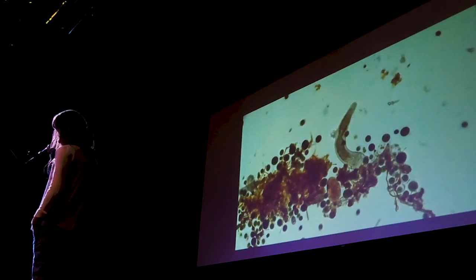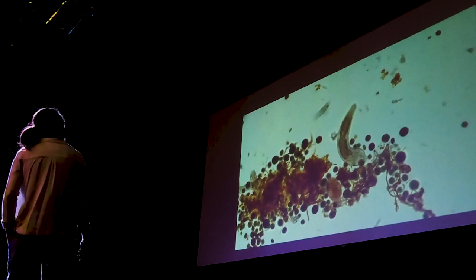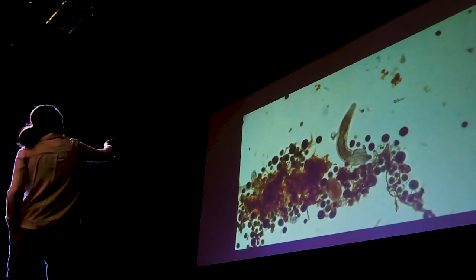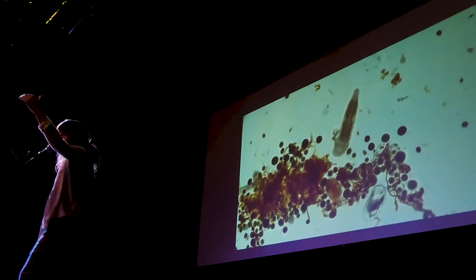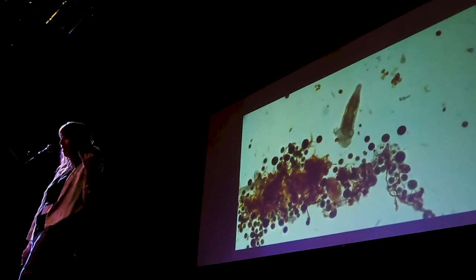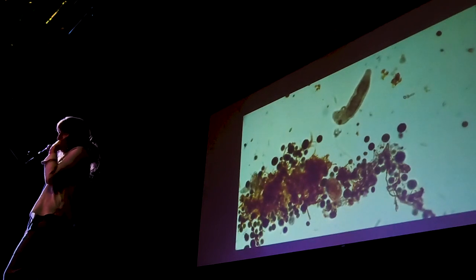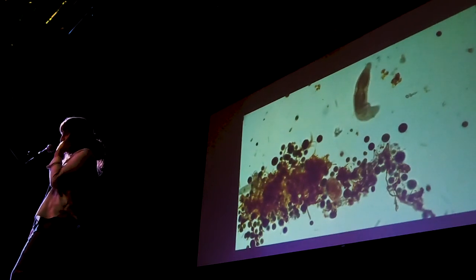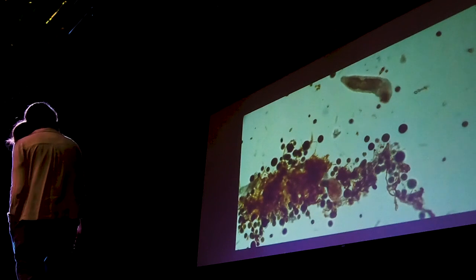So this is from a stagnant pond system, right? And we look at it and you can see these balls. Sometimes with our compost, we use NID water, and the water goes from the NID into a pond and then into our compost. So we can actually use these organisms to detect when our pond has too much algae in it. I'll look at a compost sample and wonder, where did this algae come from? Well, it's coming through the pipe, through the water. But this is very typical of what a stagnant pond sample is going to look like, something that's not aerated.